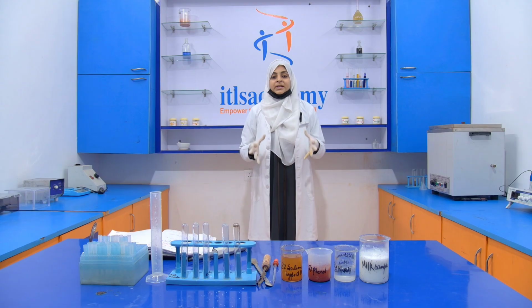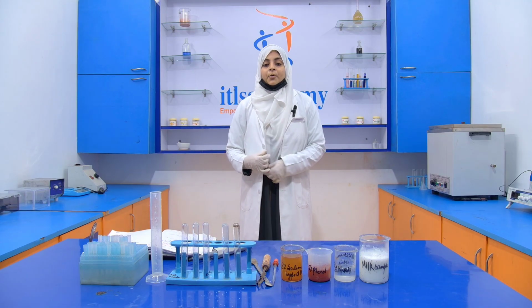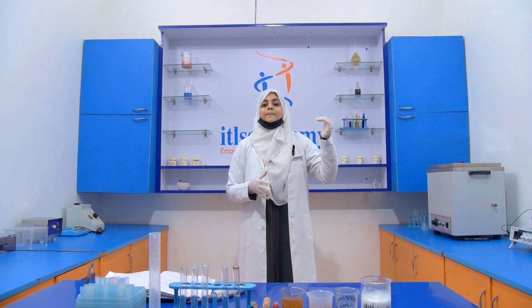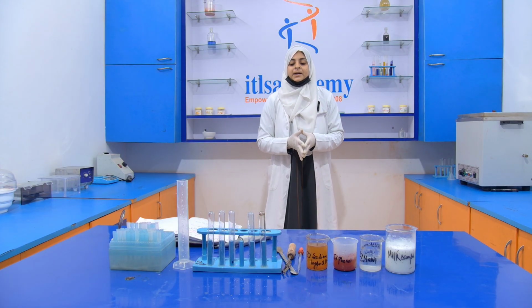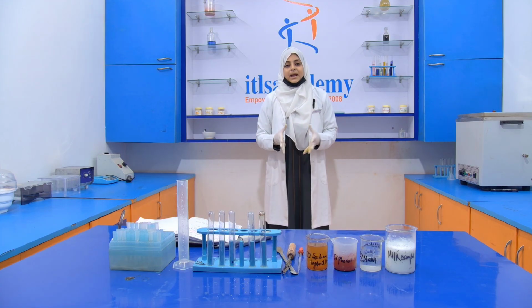If during testing they find any adulteration in a product, then that shop is totally banned. Now here, what is the adulterant? Ammonium salt acts as an adulterant.